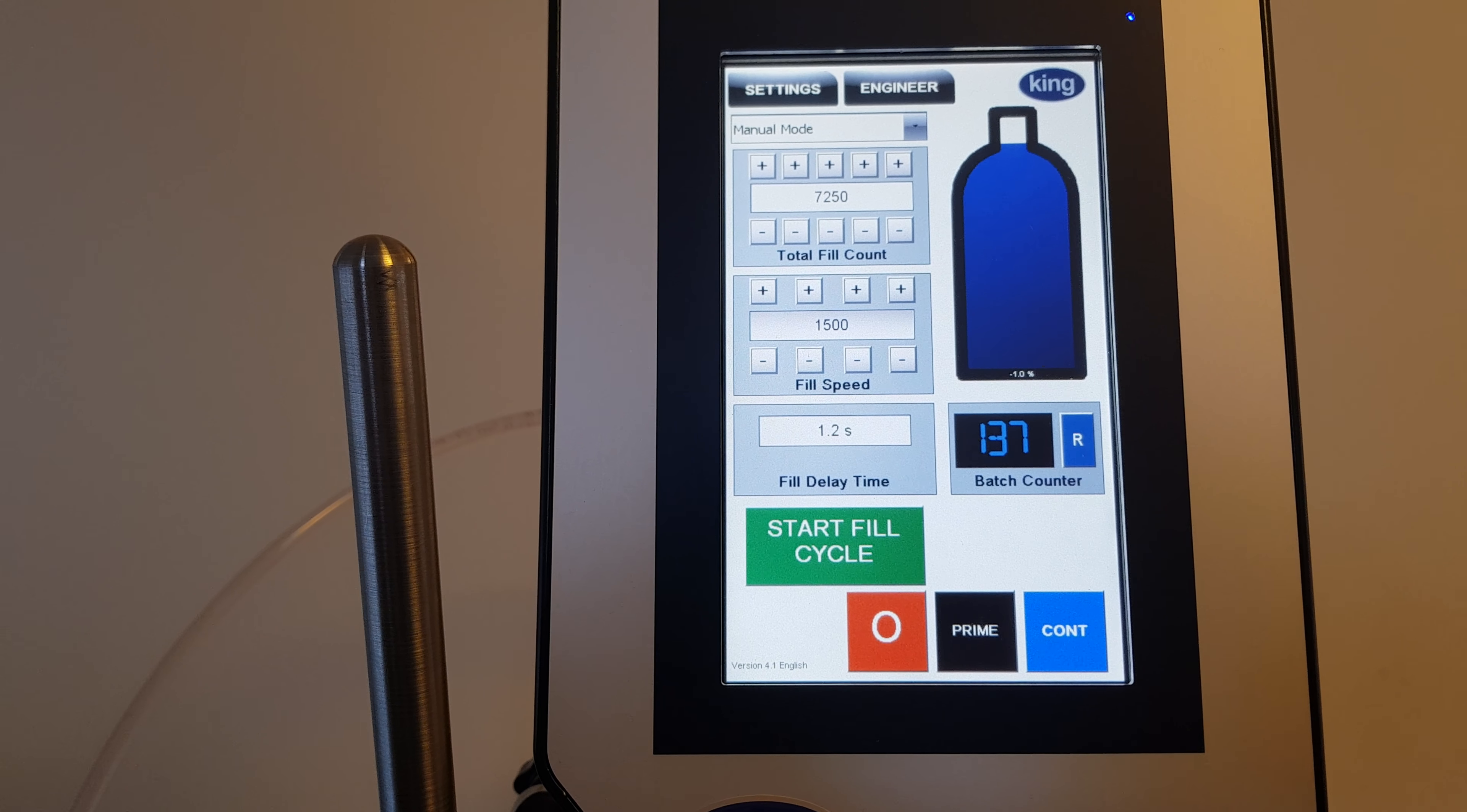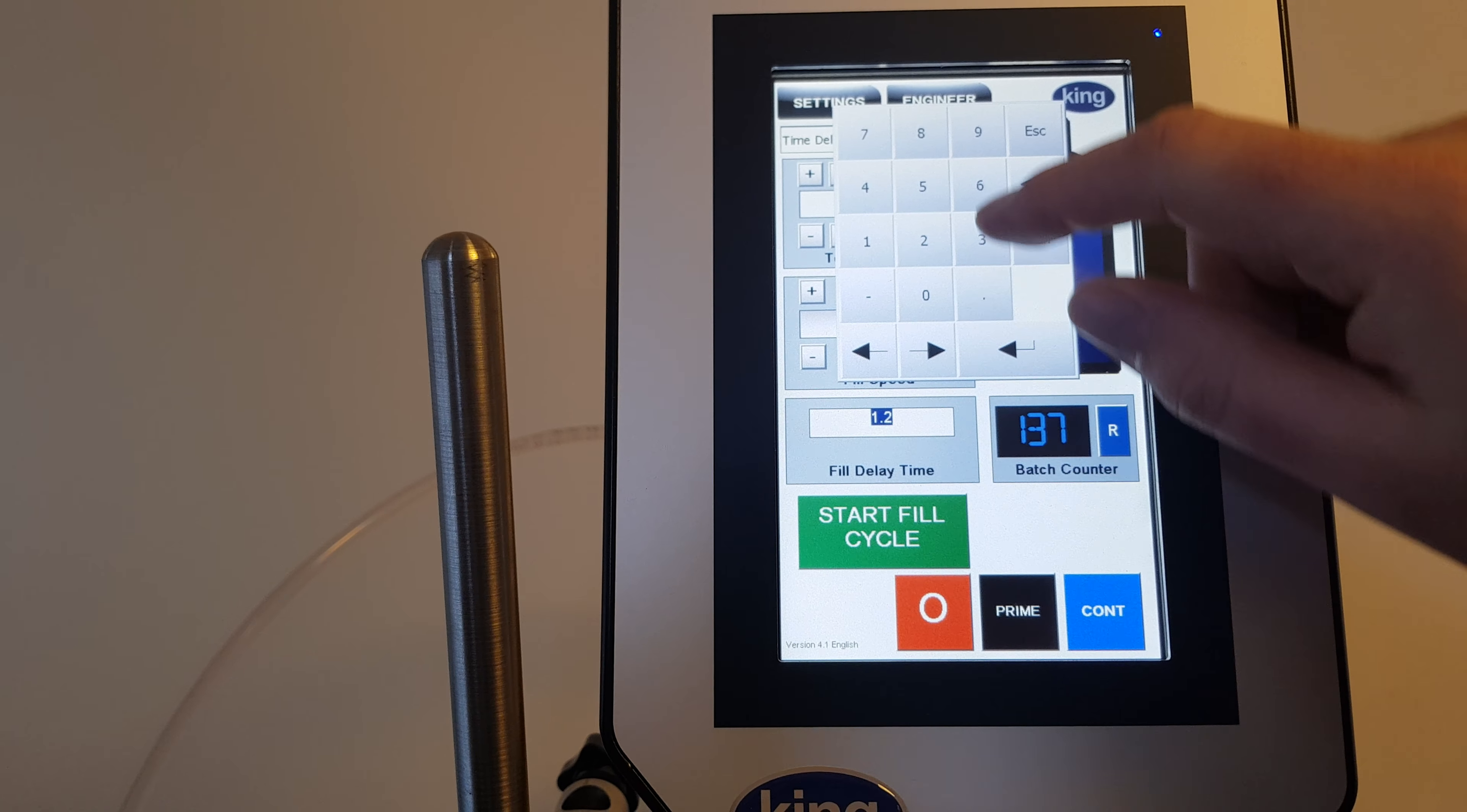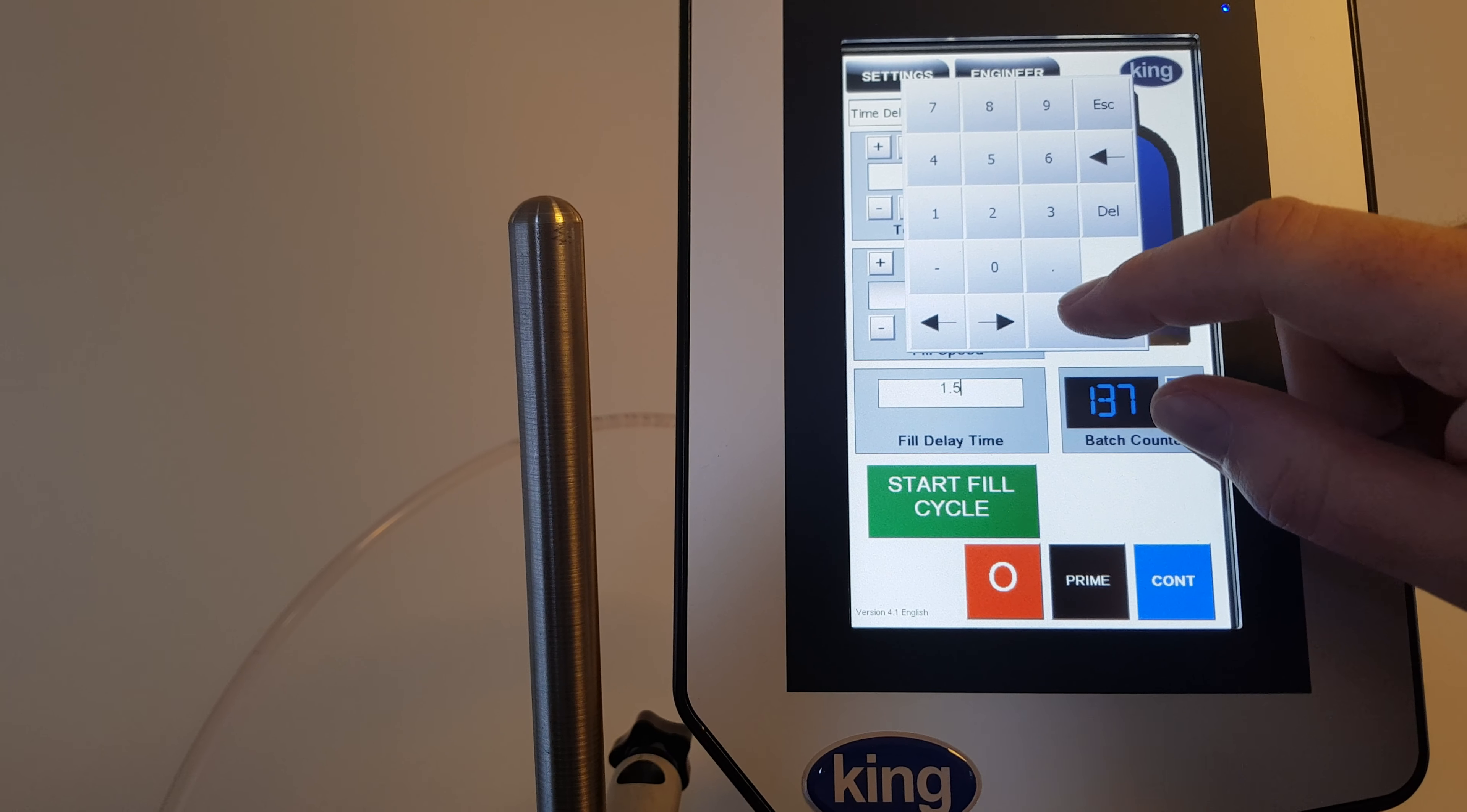Going from manual mode to automatic mode or time delay mode, we just press the time delay. Now we're in time delay mode. I'm going to set that slightly higher because I'm already fast at these things, so I'm going to give it 1.5 seconds between fills. Some people can do this with like 0.2 seconds, but it's not for me.